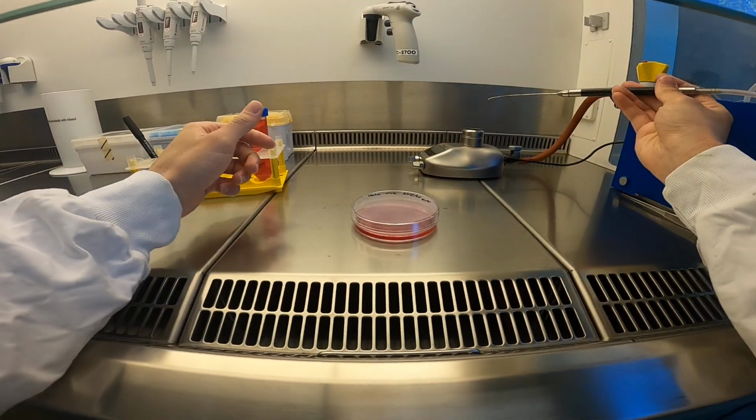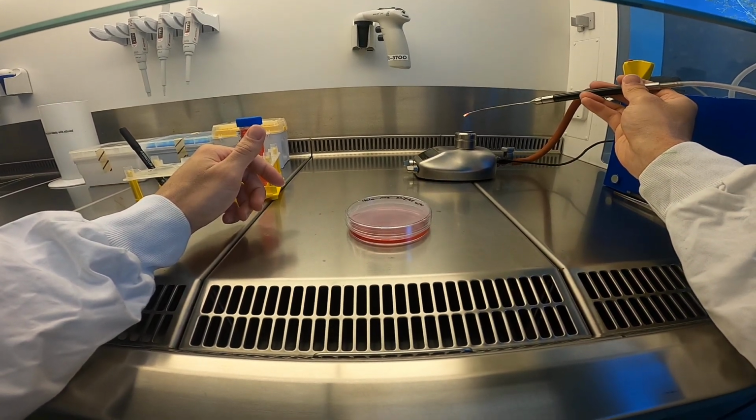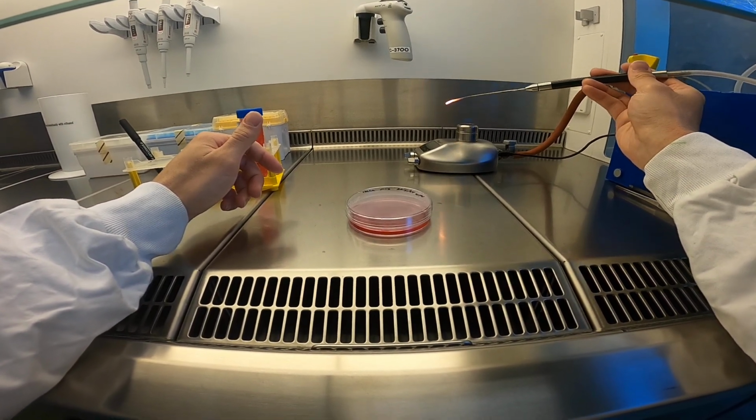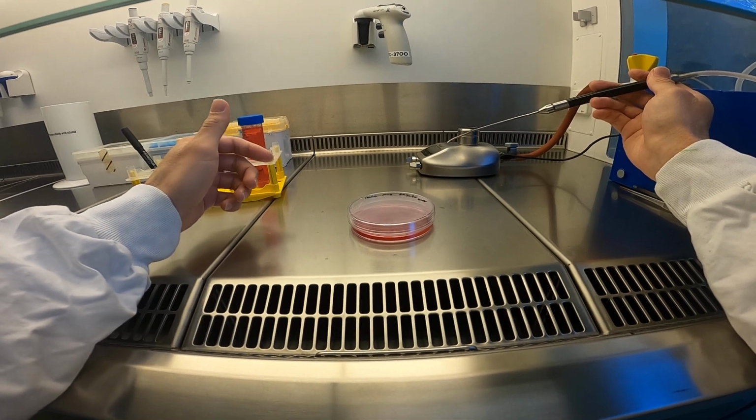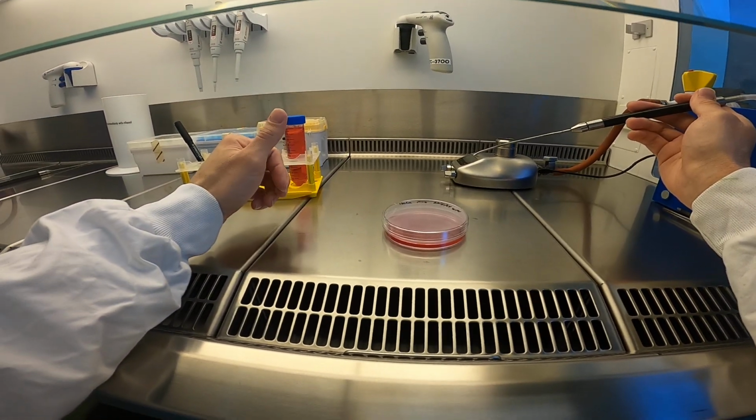Then I grab the platinum needle, I turn the flame on, and I hold it on top of the flame until it's glowing. Once it's glowing, I wait 15 to 20 seconds until the needle has cooled down enough.